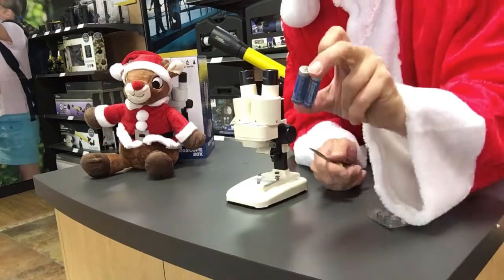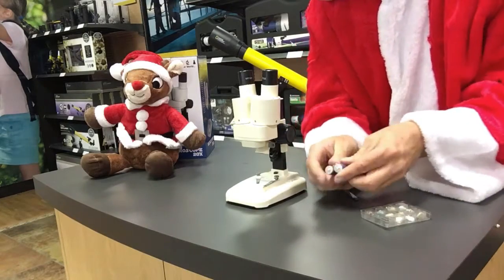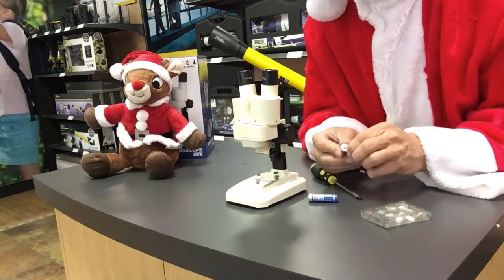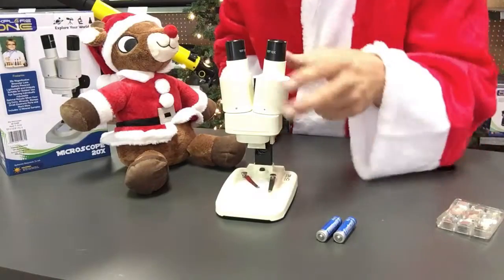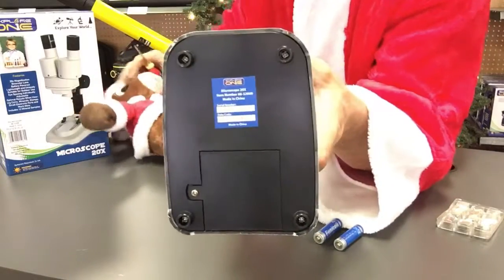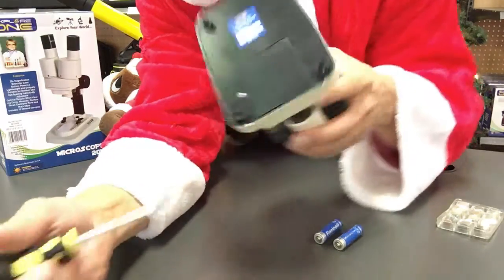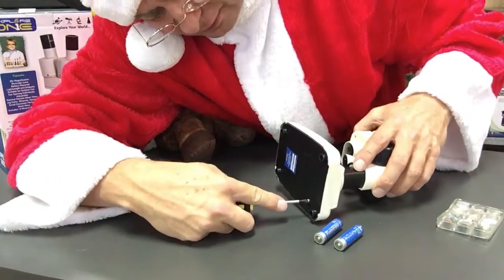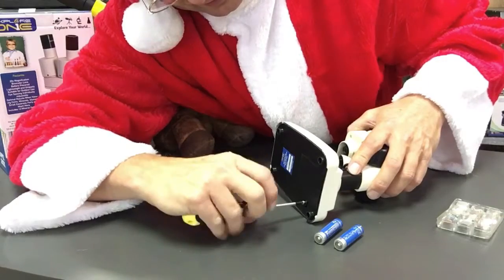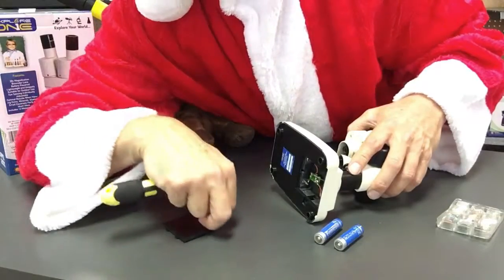Now we need to put in these batteries. We've got plastic around them, so we're just going to cut through that plastic and peel it out. And that's going to light up this light right here so it can light up our specimen. The next thing we have to do is open up the battery compartment door. Underneath here is a little screw that we have to unscrew to get the battery compartment door open. So we're just going to do that right now. Slowly unscrew that until you feel it come out. And that's the door right there.